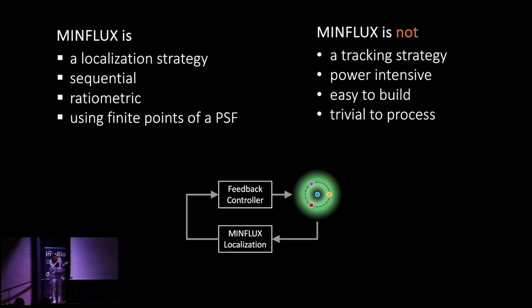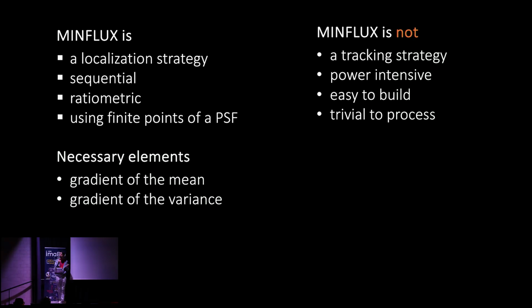It is not power intensive. You use tens of microwatts. It's not easy to build. I'll show you now. And it's not trivial to process, because if you want to localize with 10 photons, you should not do maximum likelihood estimation. Happy to talk about that later.